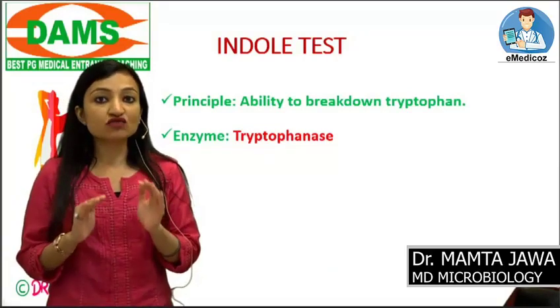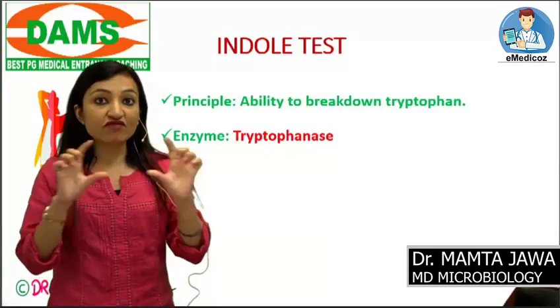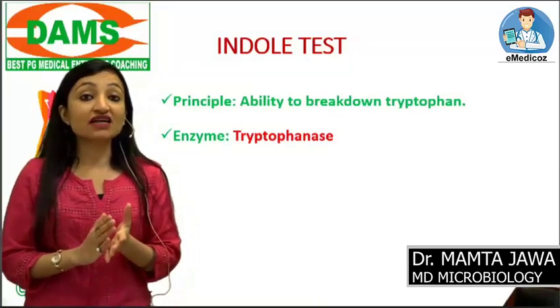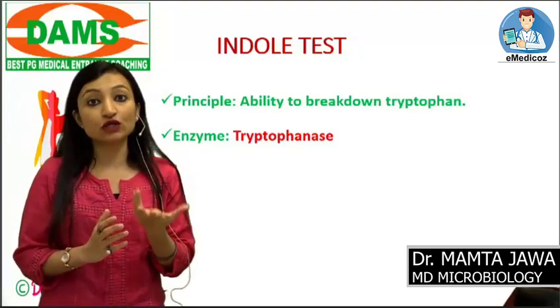Okay, so in this video module I have picked up the very first test of the IMVIC acronym, that is the indole test. Right, now let us understand what exactly is the purpose behind doing the indole test, and what's the principle.